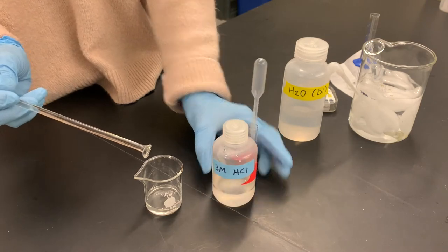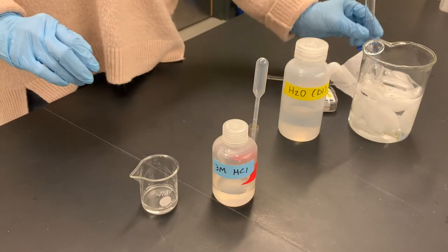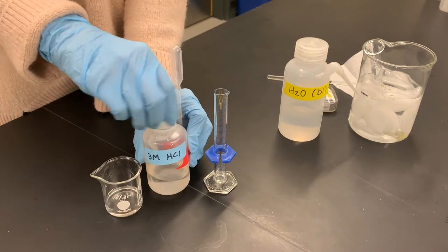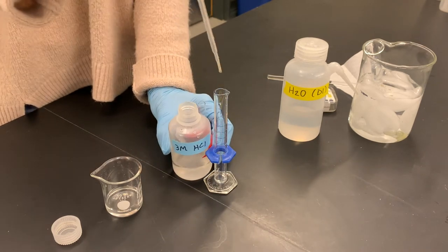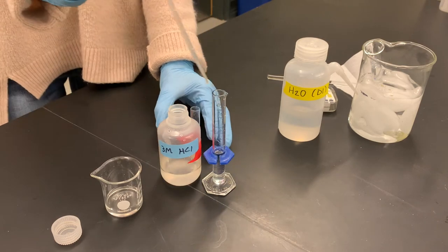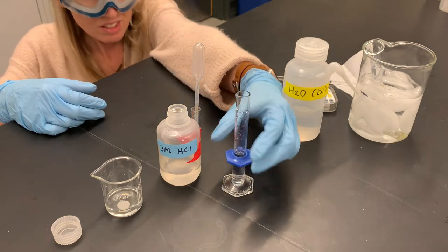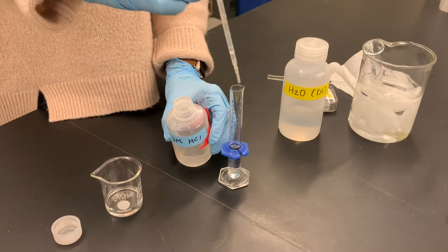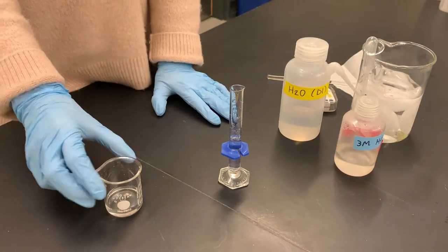The amount of hydrochloric acid needed depends on exactly how much we started with, but one of the nice things is that we really can't add too much. We're going to start with 5 milliliters. I'm using the exact same graduated cylinder I used for the water, which is totally okay — we don't have to worry about contamination because there's already a lot of water in there. It doesn't matter if we add too much; we're just trying to make this solution acidic.